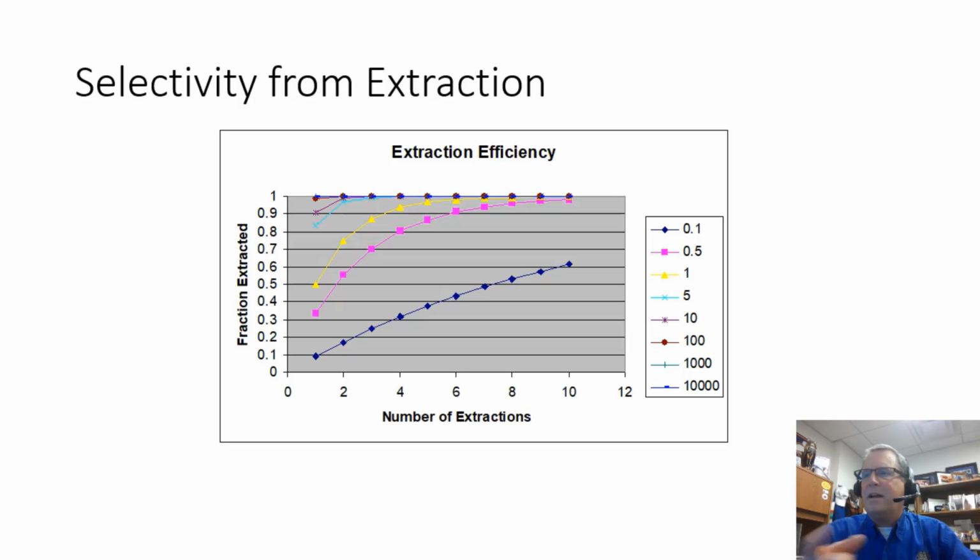It helps me think about, and we may see some of this data, maybe a type of extraction where I might extract in a microwave assisted system into water instead of extracting into an organic solvent. And water, of course, is a much greener place to go than that organic solvent. So those are the kinds of things that we might think about and come back to our partition coefficient.